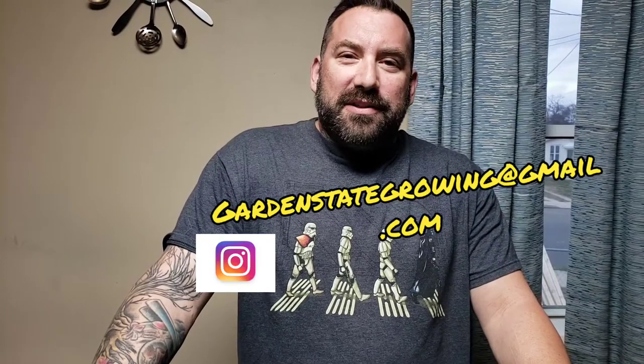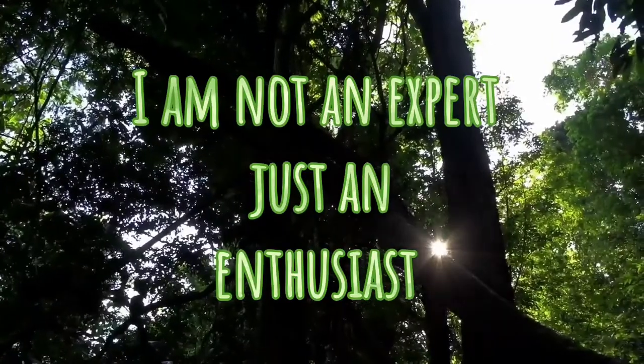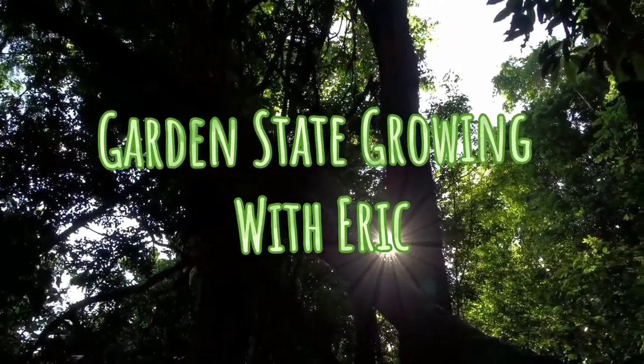Hey everyone, welcome back to Garden State Growing. My name is Eric and we're here to clone some mushrooms. Cloning mushrooms is pretty straightforward, but this is the point where sterility makes all the difference in the world.